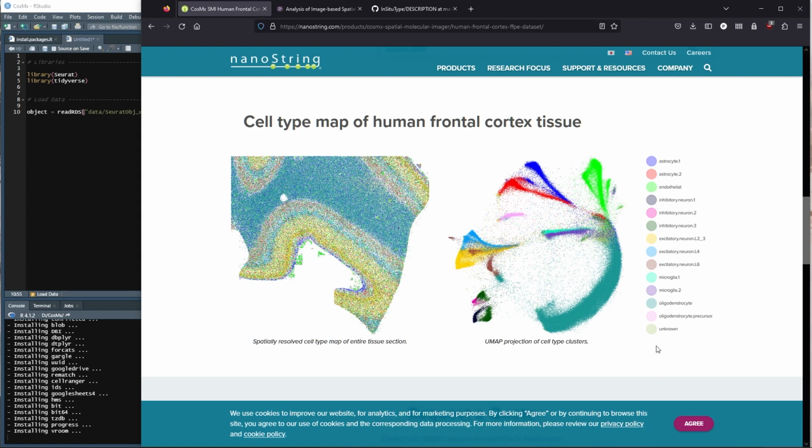But with the unknown, we can go through and look at things like the Human Protein Atlas. It's not as automated, of course. You're going to have to manually do some of that stuff, but you'll be able to phenotype those on your own.